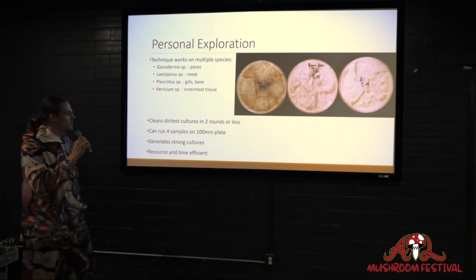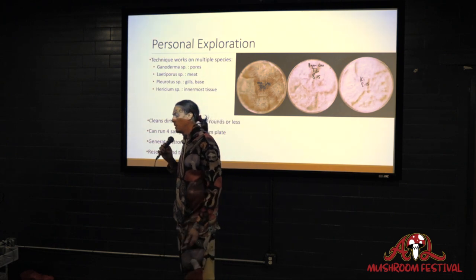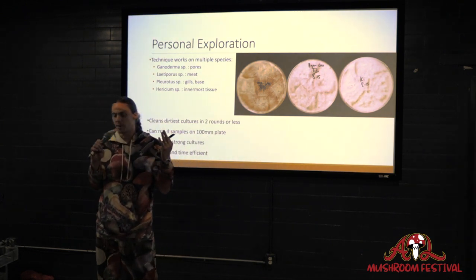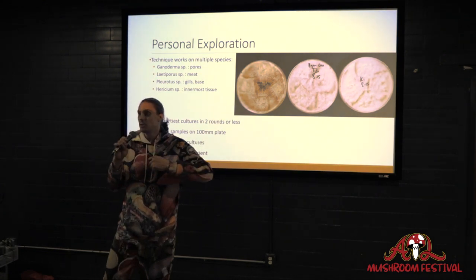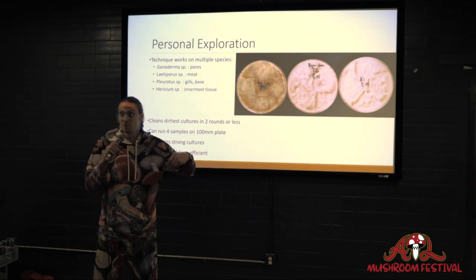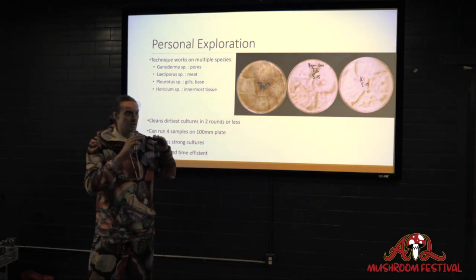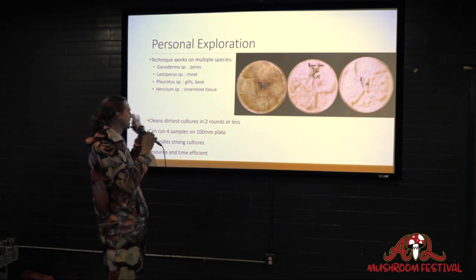And so what's great about this technique is a lot of people, when they're running away from contamination, it may take them, in their minds, 5, 7, 10, 20 plates. It can be a long time. If the sample was very heavily contaminated, you might be running for a while. And even then, you're selecting until you stop seeing the booger on your plate. But I've already told you there's a 97% chance that it's still there, and you just don't see it, right? So even if you're running away, you're not actually getting rid of it. You're just masking it until it gets to rear its ugly head later down the line.